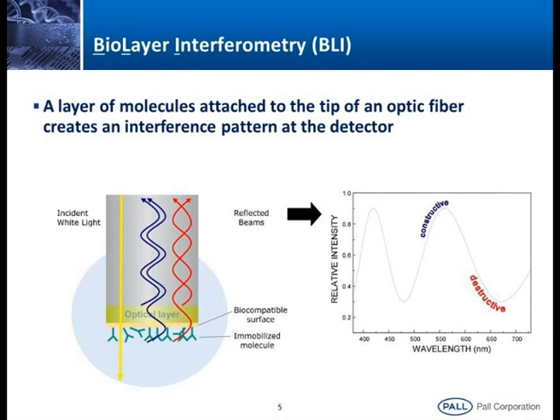So how exactly does this technology work? As I told you, it works on the interference pattern. Interference patterns make the signals here. I am passing a white light, only from 400 to 800 nanometers, it is not UV-based. The light gets reflected back; it is a reflection-based phenomenon.